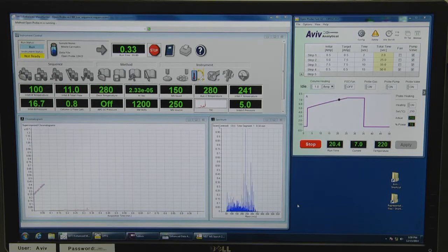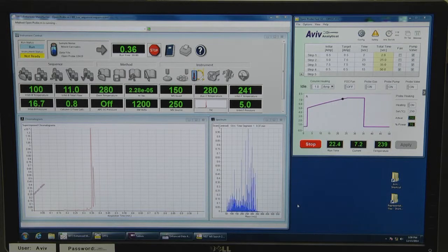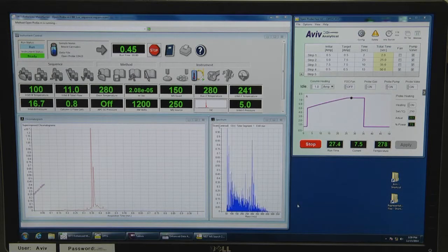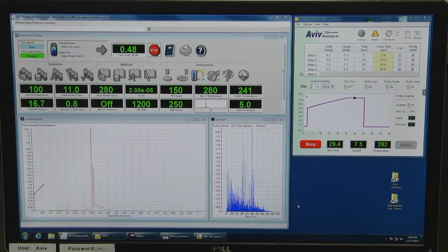After about 20 seconds, the main cannabis active ingredients elute, and after 30 seconds the chromatography ends and ultra-fast column cooling begins shortly after that, ready for the next analysis in 50 seconds.